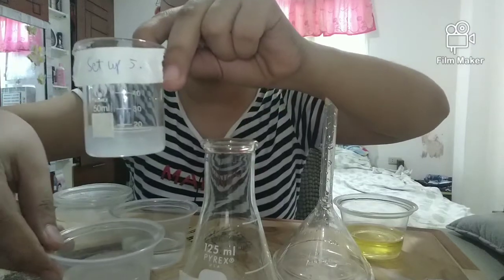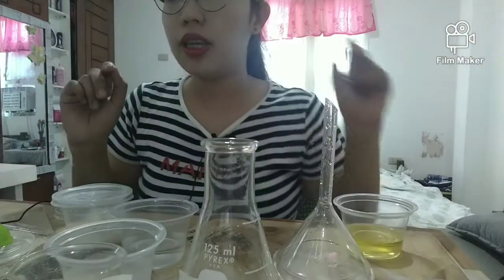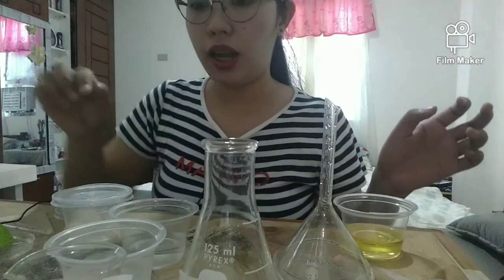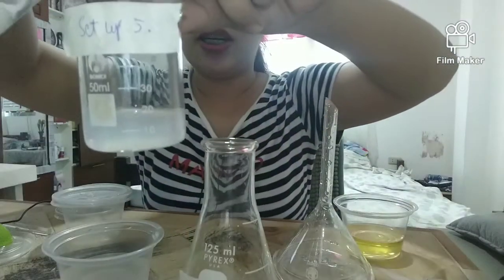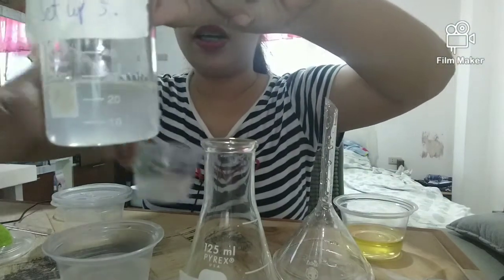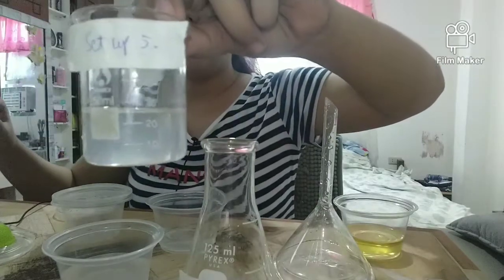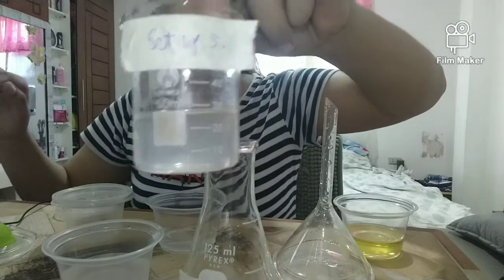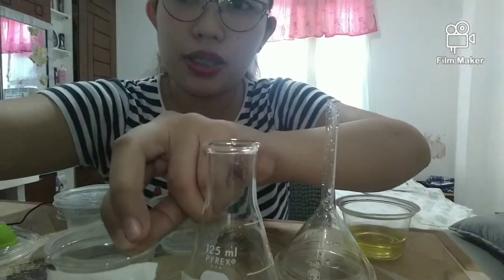I have here 20 ml of vinegar, and I'm going to mix in 10 ml of alcohol. What do you observe on setup number 5? Just write it on your answer sheet.